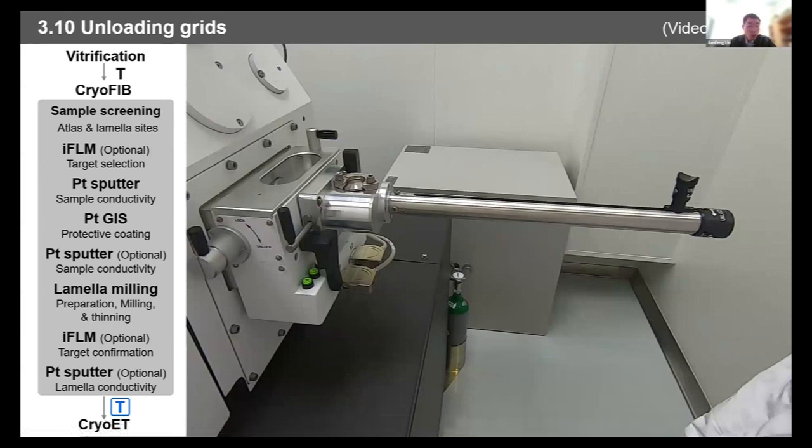For example, the cryo-TEM, to collect single particle data, either in situ single particle data, or just to do electron tomography work. And as mentioned before, the marker will help you to rotate the grid 90 degrees. This is needed for the current version of Aquilos 2 and Aquilos 1. And for Arctis, if you use specially designed grids, then this may not be needed.